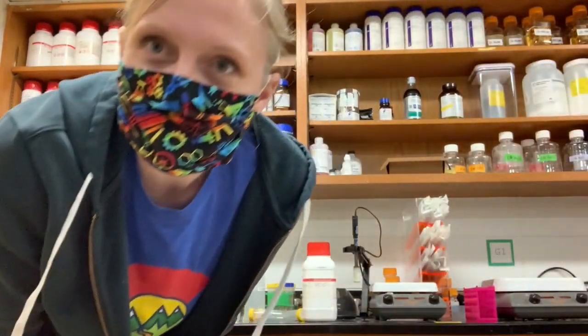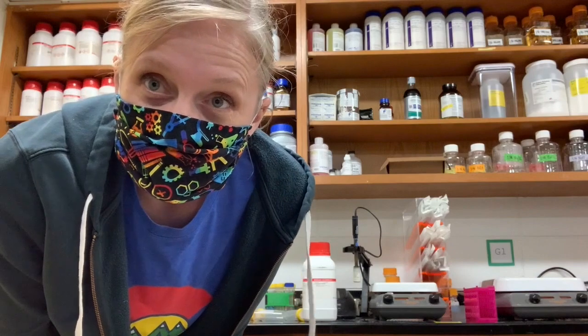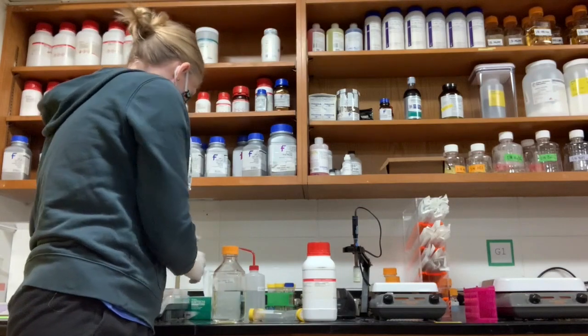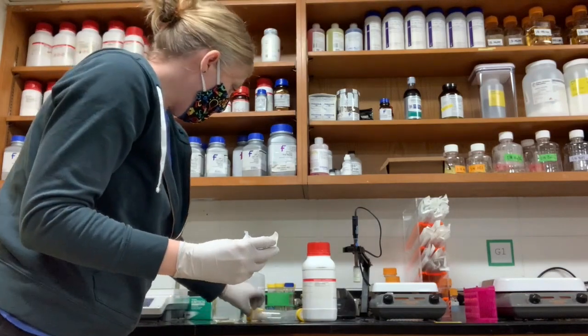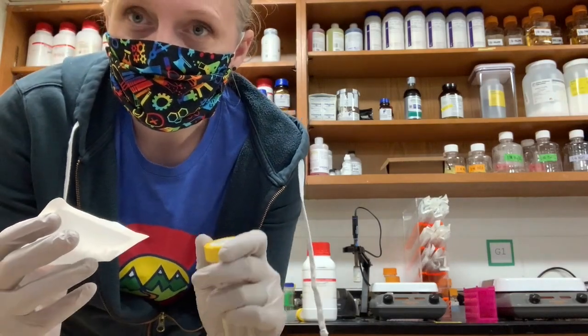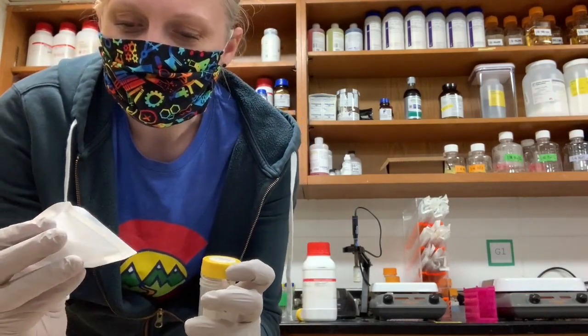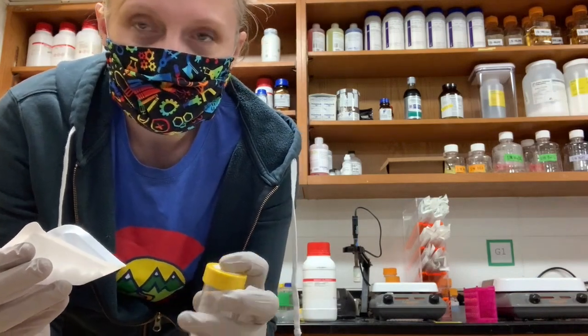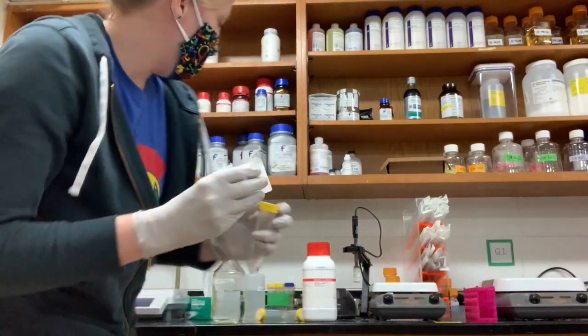So you want to be as precise as you can. The quality of your chemicals is going to determine how well a lot of your experiments will work. So you want to be pretty precise with measurements of this type. Once I have this measured out, I'm going to pour it into my tube. There's actually quite a lot of this, so I might even scoop part of it with the second weigh boat. And then I will show you how to fill it with water.